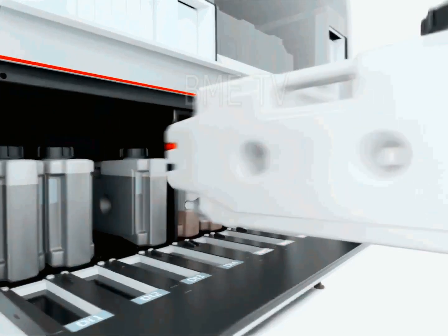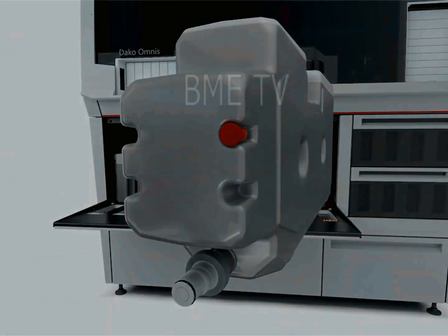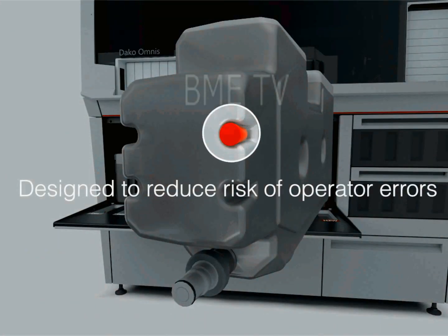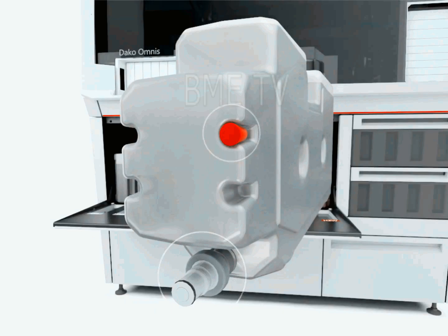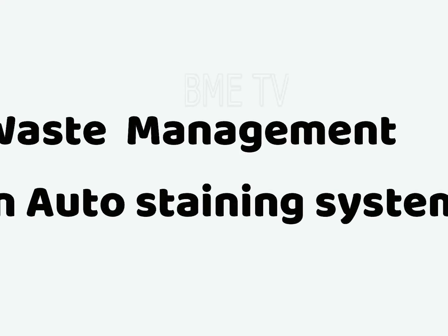All automated IHC systems require a mechanism to deliver precise amounts of reagents to the slides. Matrix and rotary are terms to describe the motion of the robotic mechanisms that bring the reagents to the microscopic slides in automated IHC systems. The fourth component is waste management.